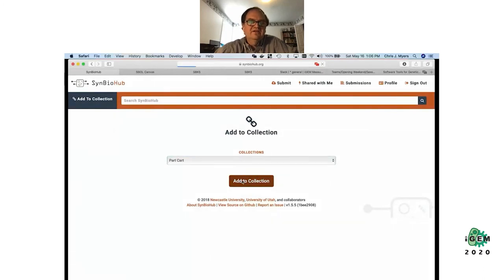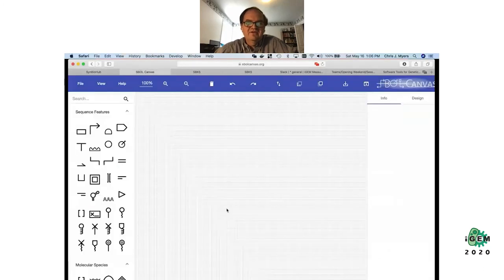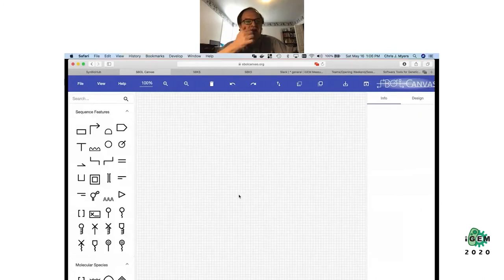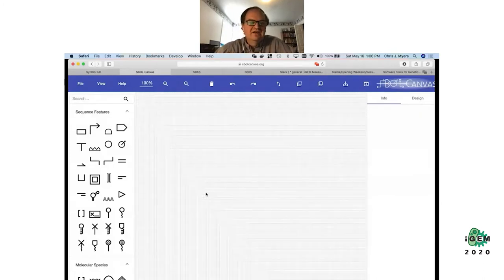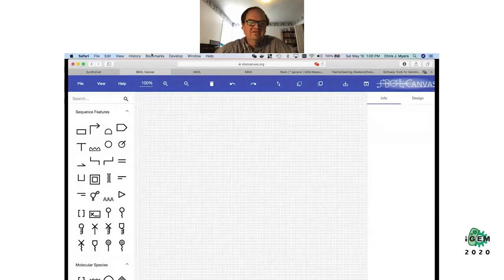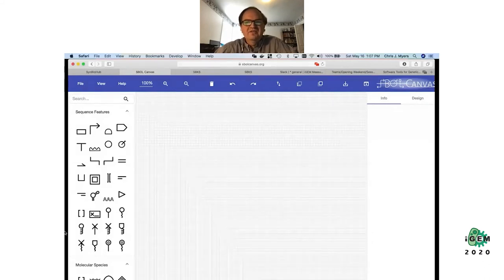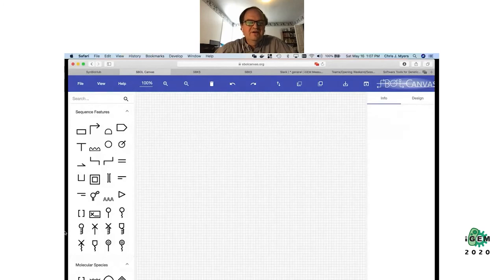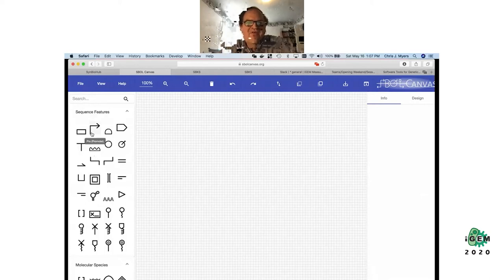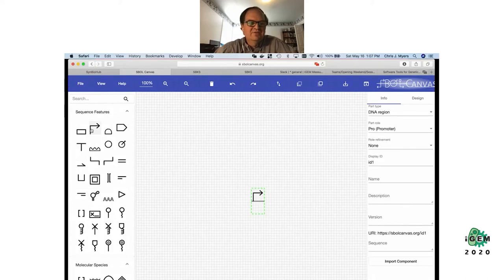Now I've built up my list of parts and I want to go build a genetic design for the toggle switch. I'm going to do that using the SBOL Canvas tool at sbolcanvas.org. This is very new — it was developed by a senior project team at the University of Utah, so it still has a few issues to be worked out, but we're quite excited about it.